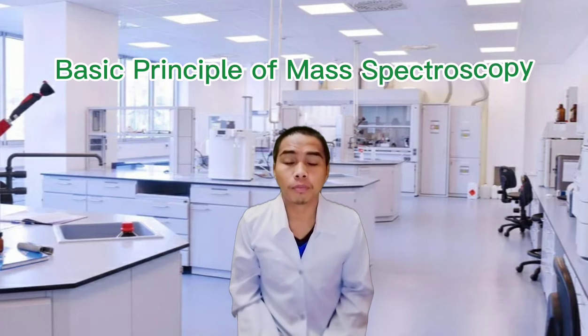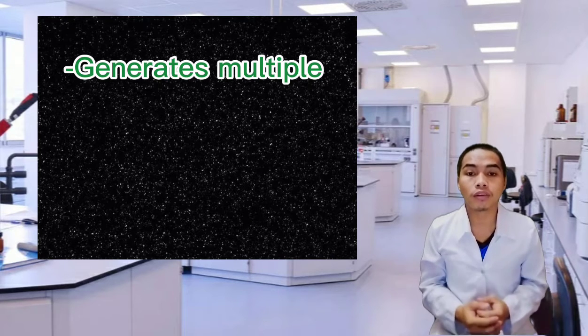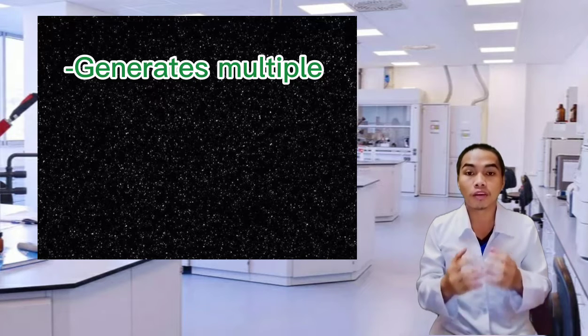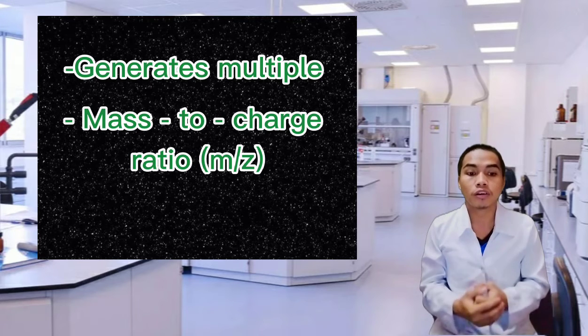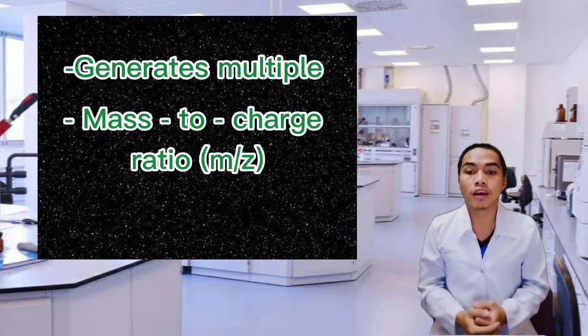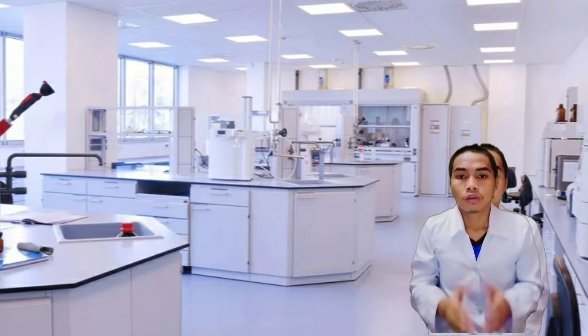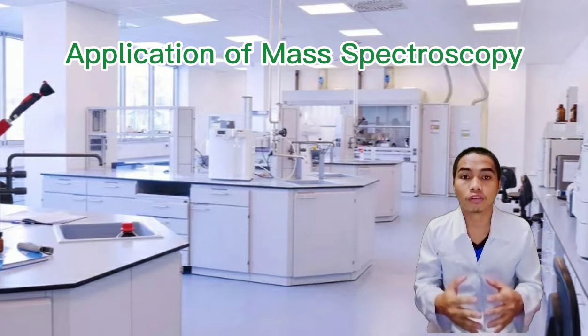So now let's discuss the basic principle of mass spectroscopy. Mass spectrometry generates multiple ions from the sample under investigation. It then separates them according to their specific mass-to-charge ratio, and then records the relative abundance of each ion type. So now let's discuss the application of mass spectroscopy.